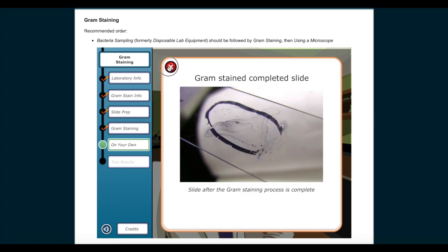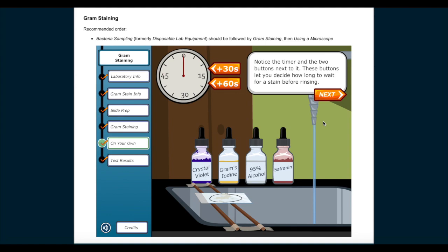Notice the timer and the two buttons next to it. These buttons let you decide how long to wait for a stain before rinsing. Remember, you can click the hint button at the bottom right for help. Click next and begin gram staining on your own.